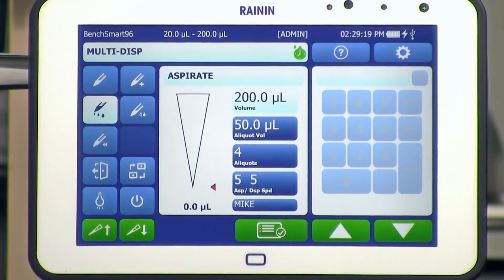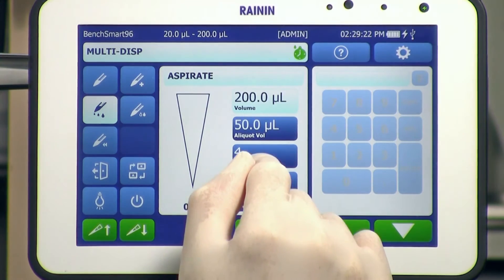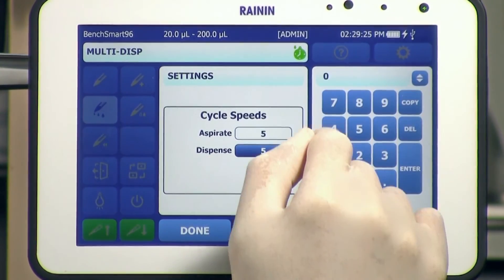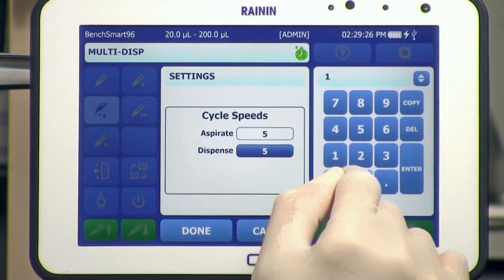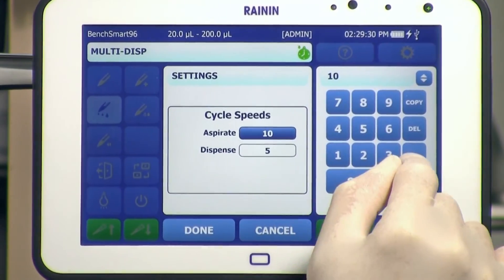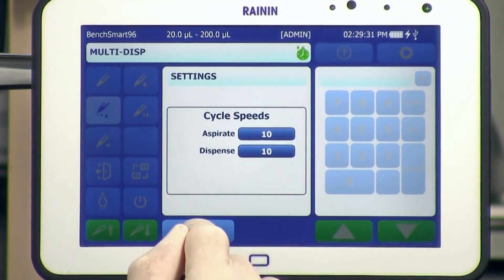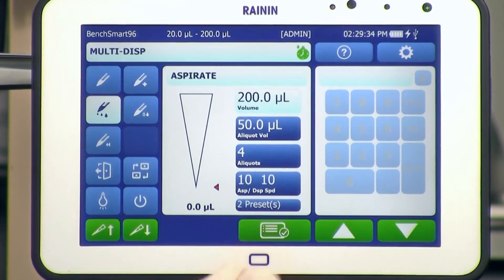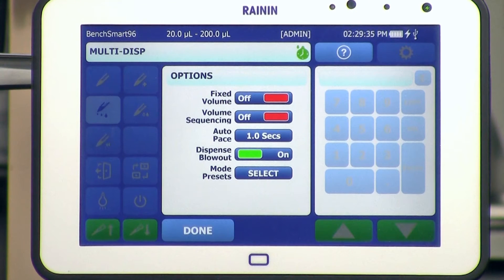Mode Presets. To add a mode preset, first enter all of the parameters you want for a specific procedure: the pipetting mode, the aspiration and aliquot volumes, the cycle speeds, etc. When you're done, tap the Menu icon at the bottom of the screen. At the bottom of the list of options, next to Mode Presets, tap Select.